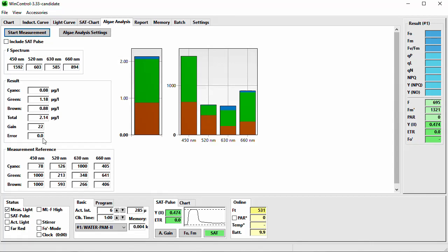There is a linear correlation of fluorescence and content of chlorophyll A within the sample. WaterPump 2 instruments are calibrated with the fluorescence chlorophyll A ratio of the Sigma-Aldrich chlorophyll A analytical standard diluted in acetone. If you want to apply different fluorescence chlorophyll A ratios — for example following a specific chlorophyll A extraction and analysis method — you can change this ratio in the algae analysis specific settings. Below the Start Measurement button is a checkbox called Include Sat Pulse — when activated, the system will perform automatically a saturation pulse measurement after the algae composition analysis.